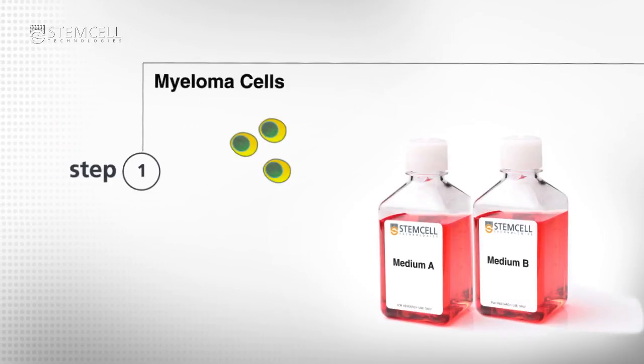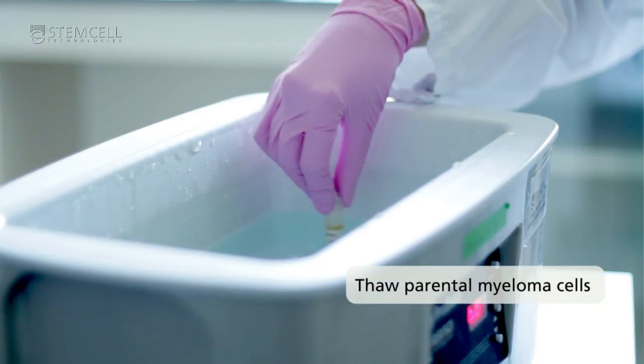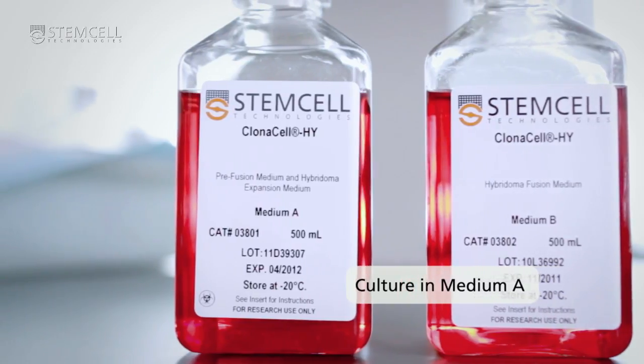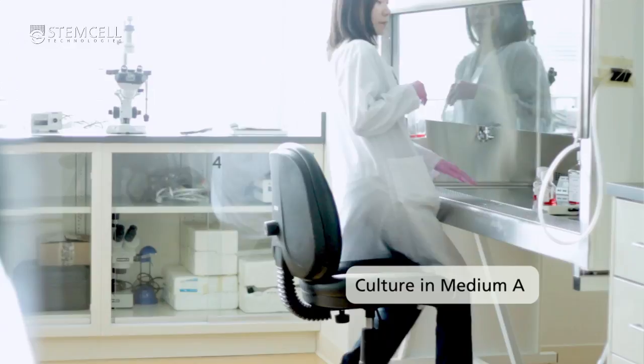To prepare myeloma cells, thaw the parental myeloma cells and culture in medium A for at least one week prior to fusion. There must be at least 20 million parental myeloma cells available for fusion. Harvest parental myeloma cells by transferring to a tube and centrifuging.